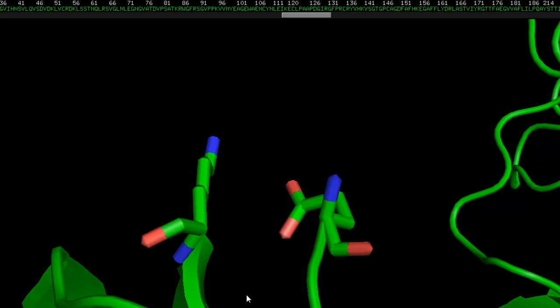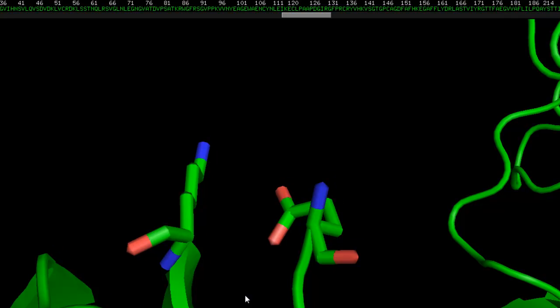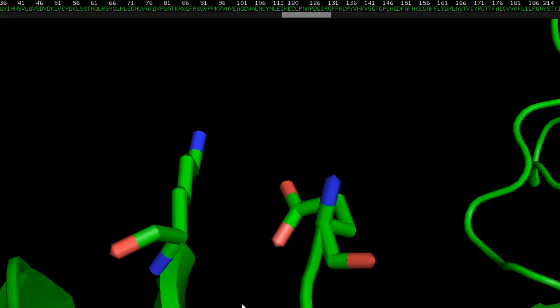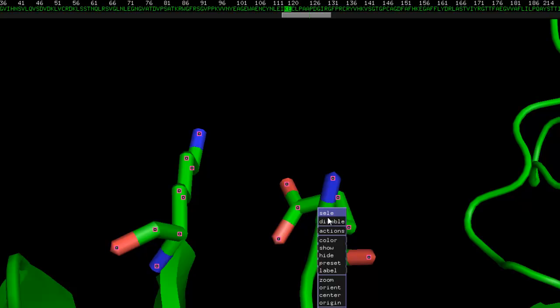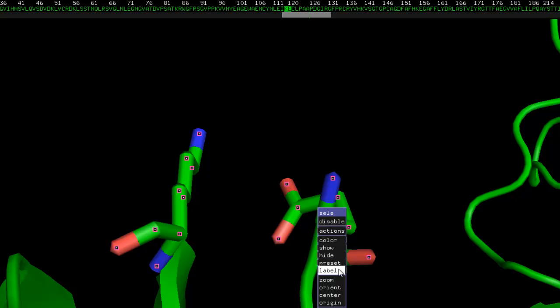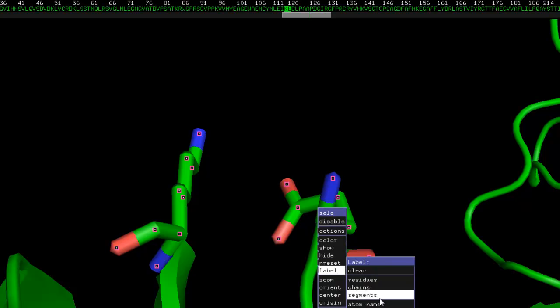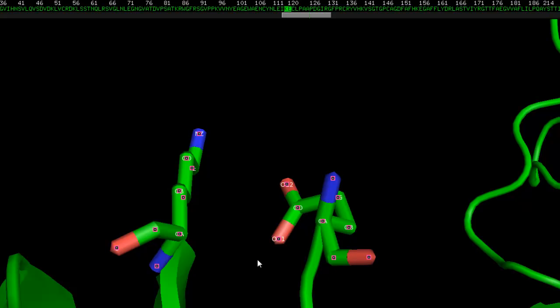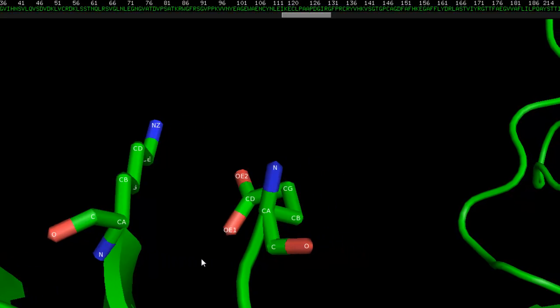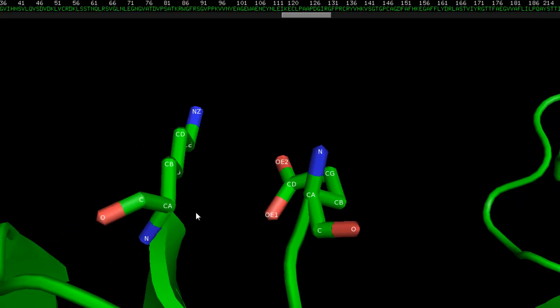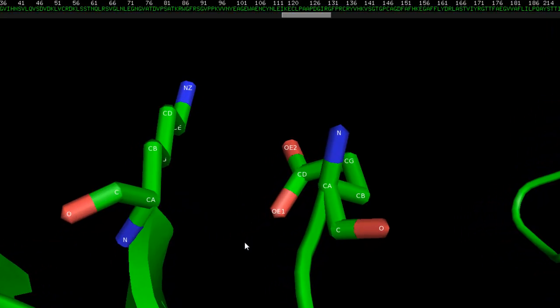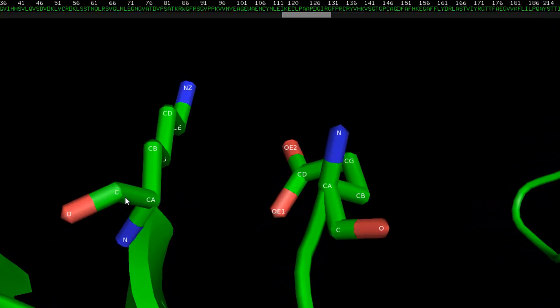Before we go to the editing menu, we're going to click on these two terminal residues. Right click, label, atom name. Now we can see the individual atoms, which makes the whole process a little bit easier. So what we're going to do is ligate or connect this carbonyl carbon onto this nitrogen right here.